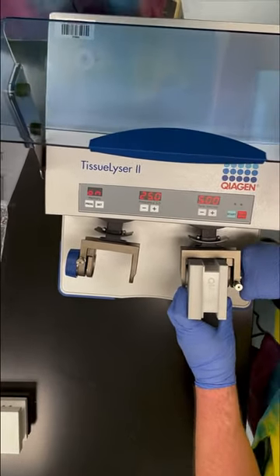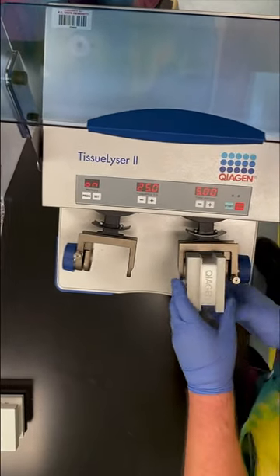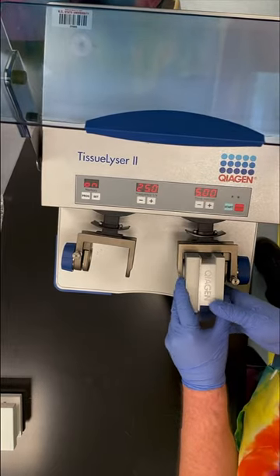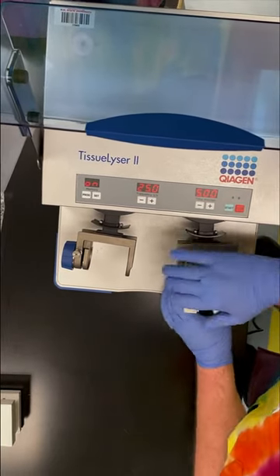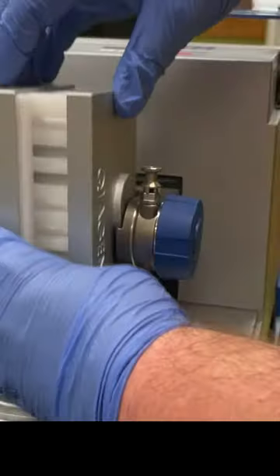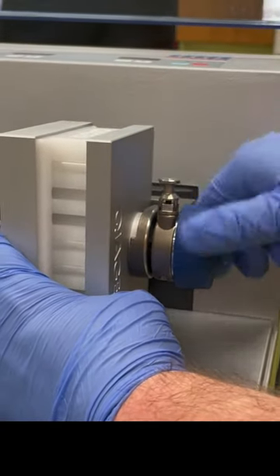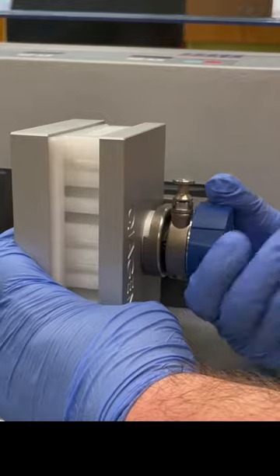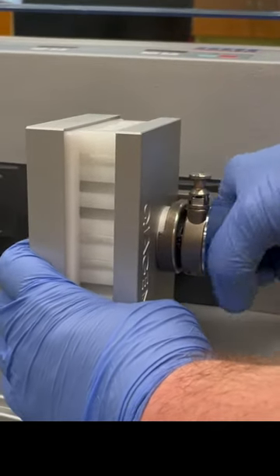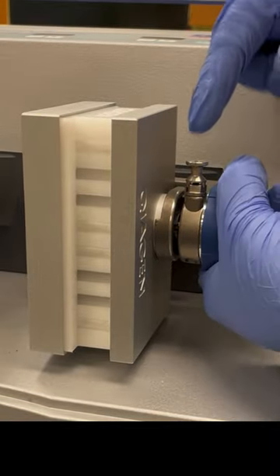I just want to get it hand tight and make sure that my safety is still in. Then I usually wiggle this a little. This is moving a little bit, but that is just the whole thing moving — it's not actually going to come loose. I'm going to put this down into its group. It's going to come up and down. You want to make sure it is all the way down.